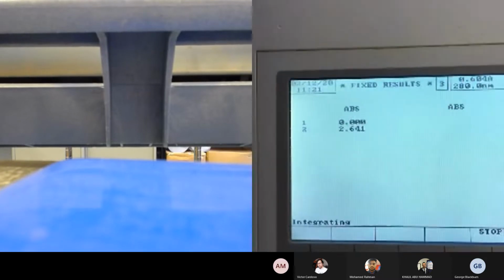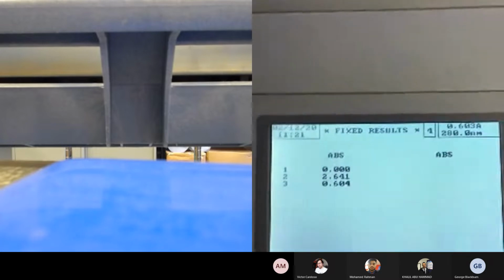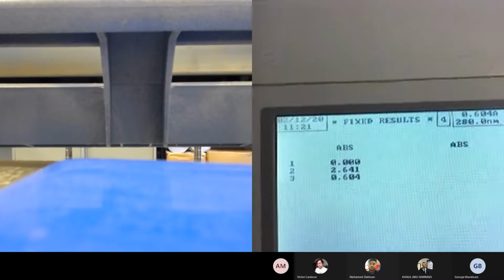Let's see. There we are, look at this. So number 1.